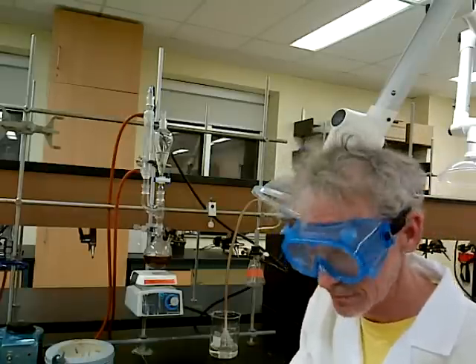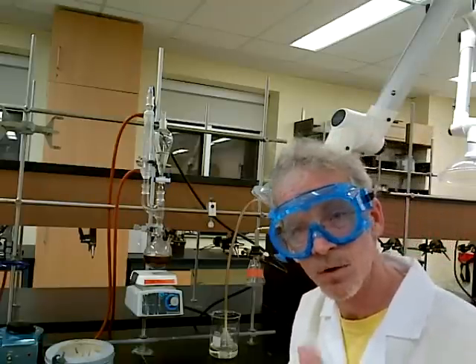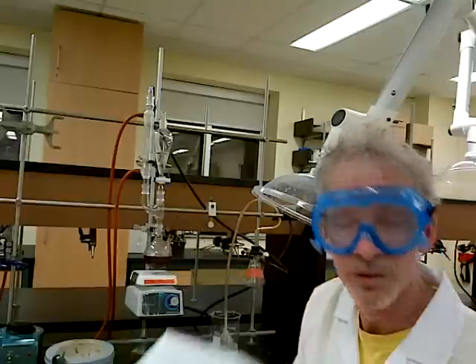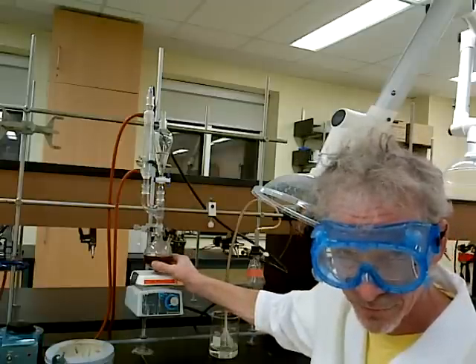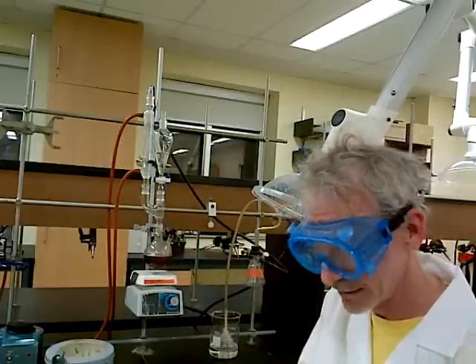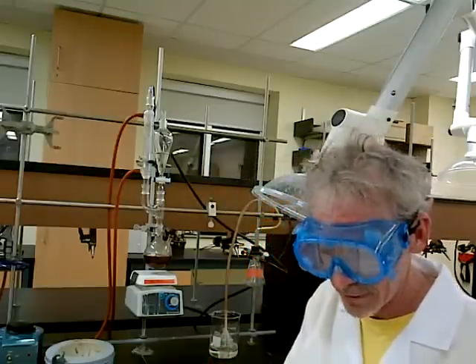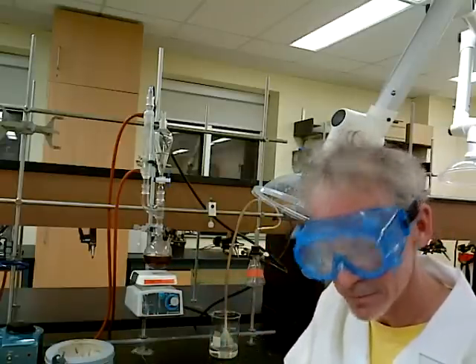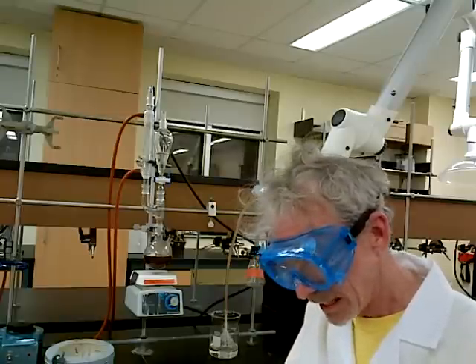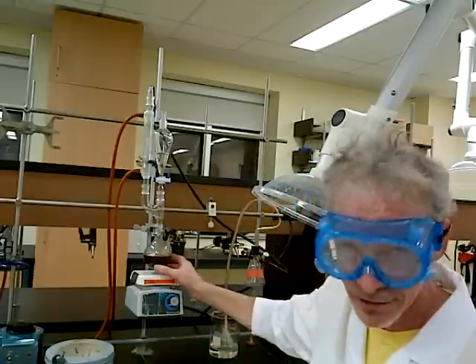The acids are the aqueous layer. Hydrobromic acid and hydrochloric acid tend to be more dense than water, and we are making an organic product. Essentially what's going to happen is we're going to see the product forming as a layer in our reaction flask as the reaction proceeds — that is what you want to keep. We'll be using the sep funnel, and instead of extractions, we're going to be washing our product — getting all that residual acid out by washing with water and bicarbonate, then finishing with more water, drying over anhydrous sodium sulfate, and then we're done. We have our product isolated that easily.